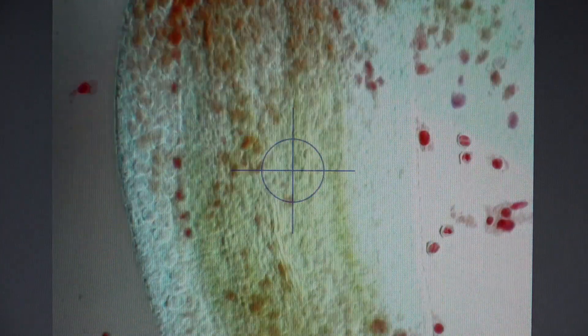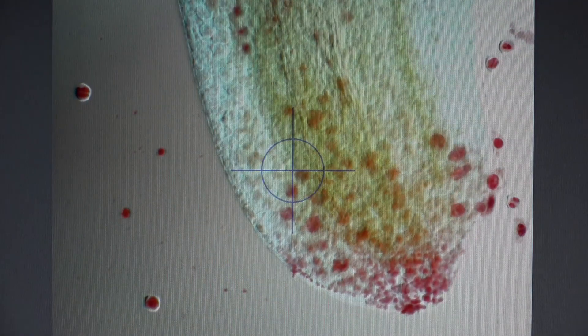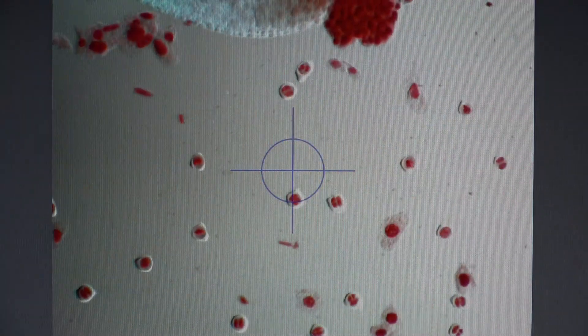It's one thing to memorize your notes, but another thing to see this for yourself. Wow. This is so cool! Look at those chromosomes go!